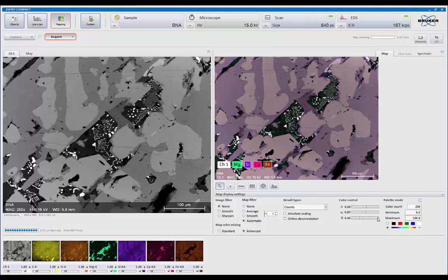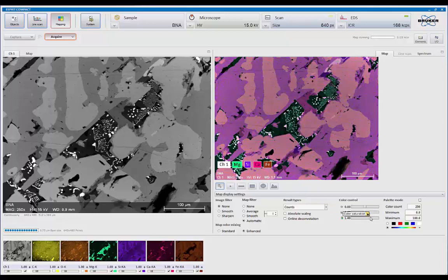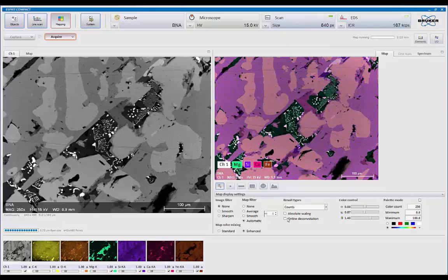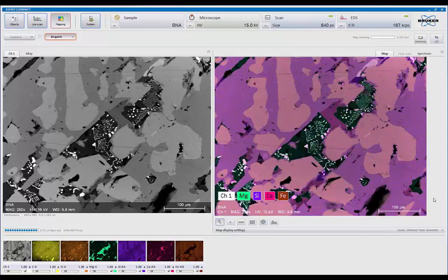You can also adjust contrast and gamma to optimize the color saturation and view of the data. See if you want it more saturated. We also have built-in online deconvolution. So if you have overlaps, the system will automatically background subtract and deconvolute the data for you on the fly.